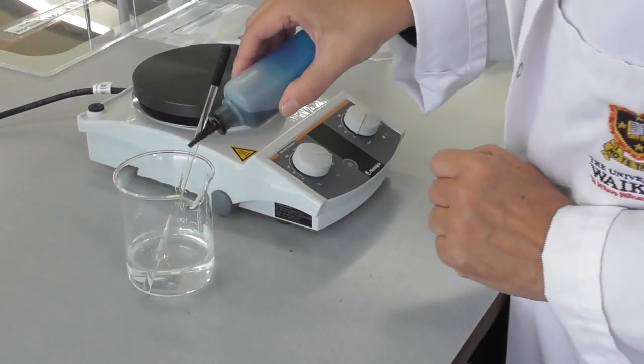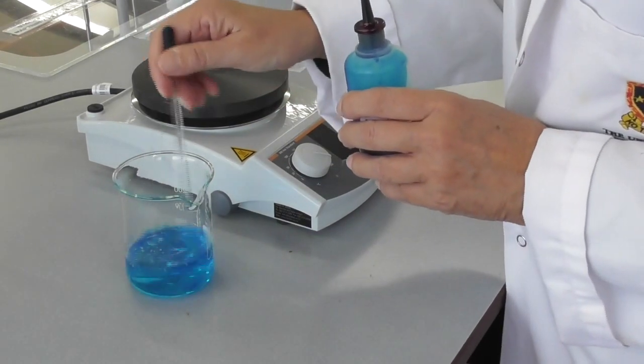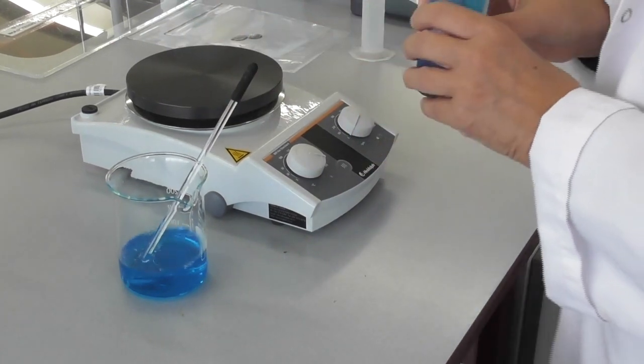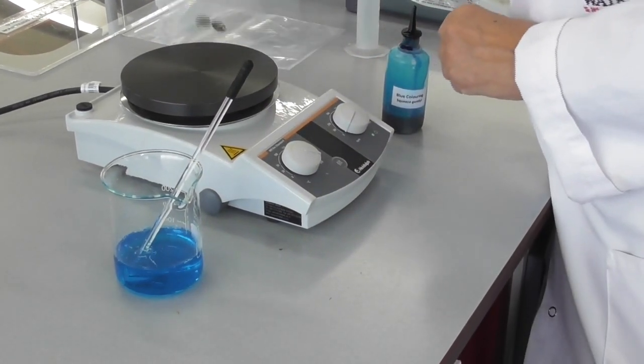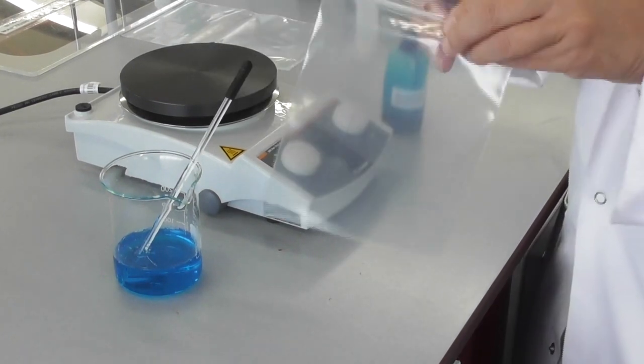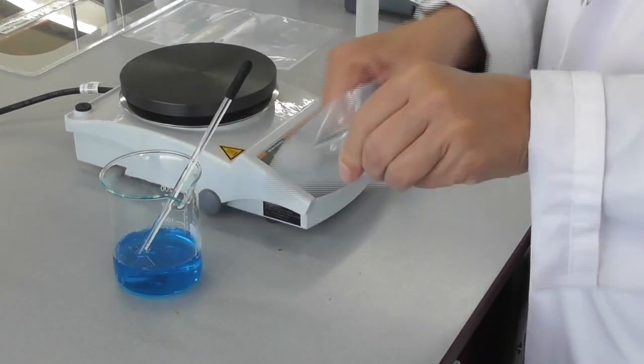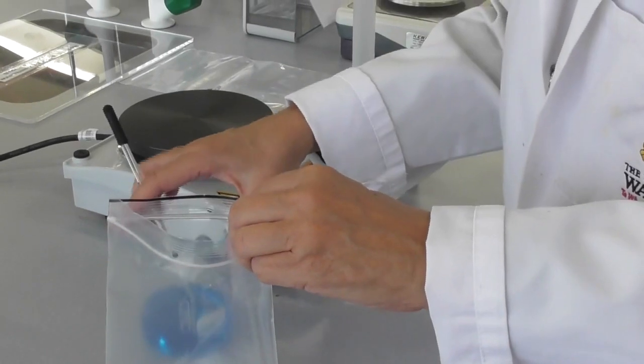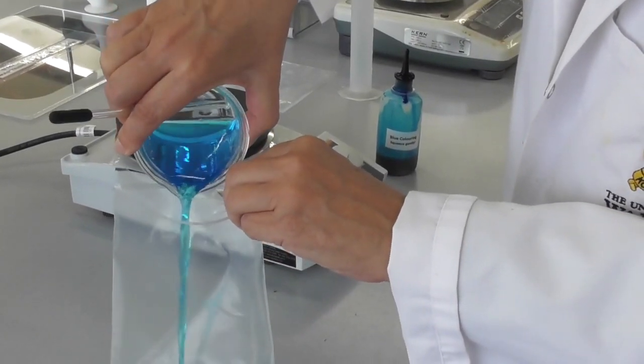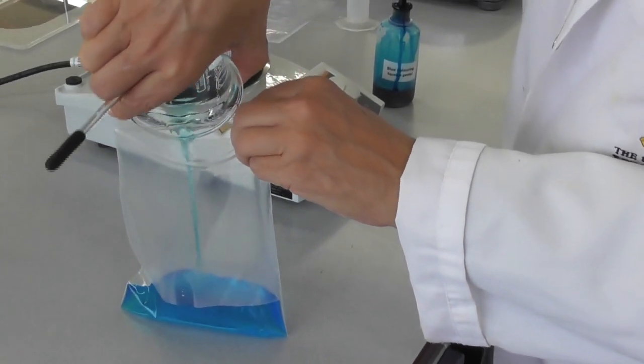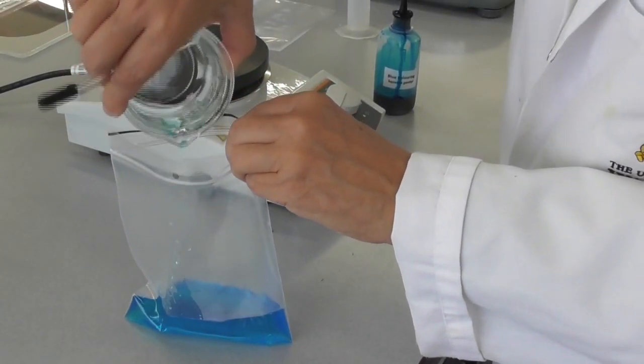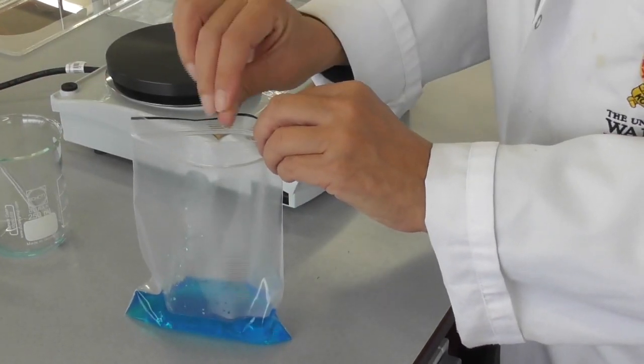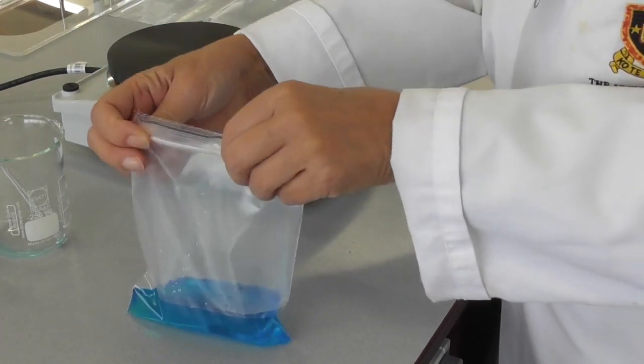We can add a few drops of food coloring of our choice. Then we pour the hot solution into a Ziploc bag. We add a metal disc into the bag and close it up.